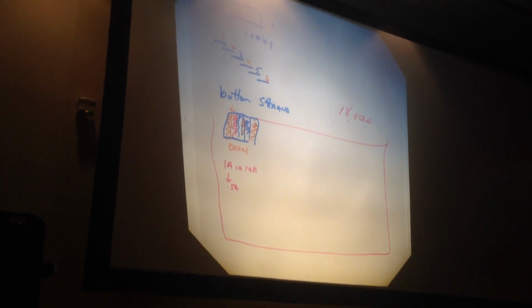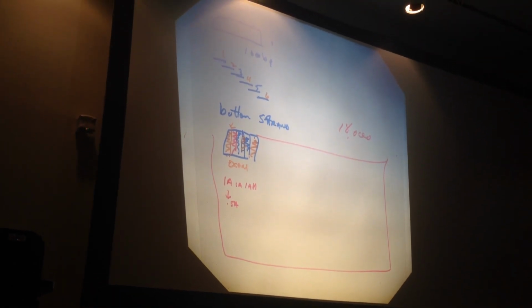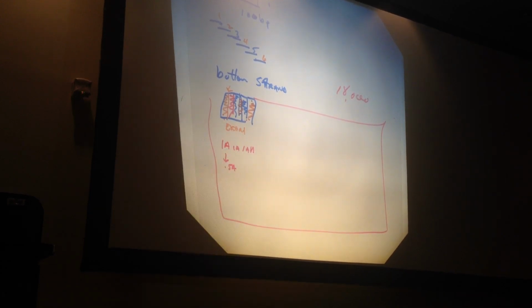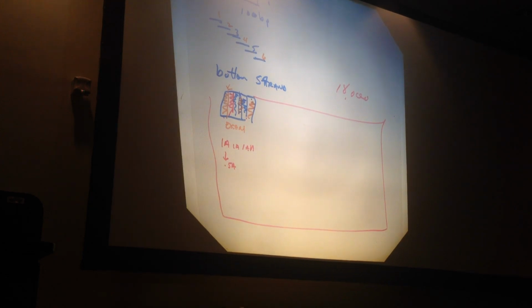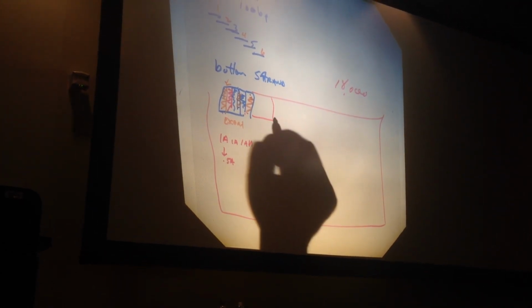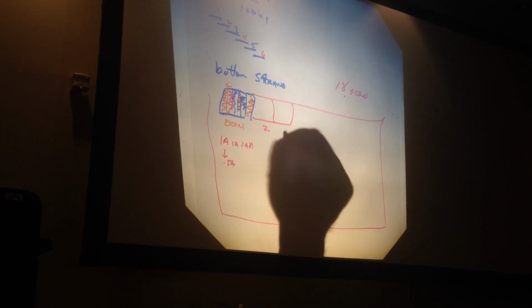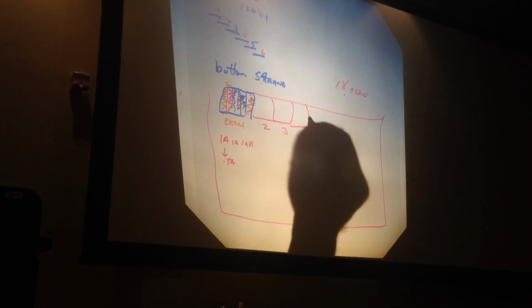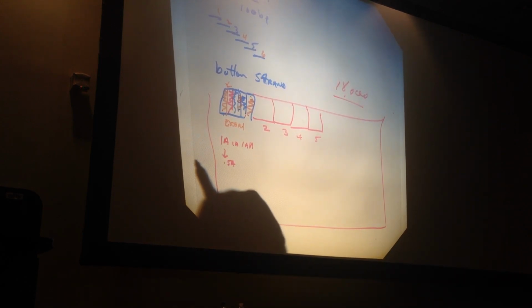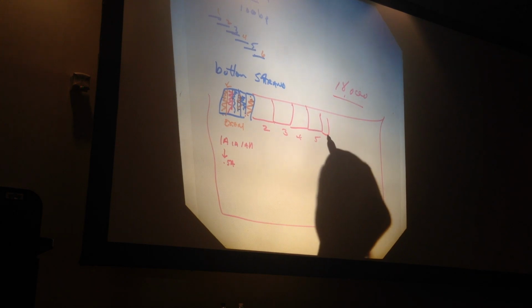In fact, they do something a little different. They actually purposely cut up the RNA. And you could also use cDNA as well. Let me just finish one more thing before we go on. You can do this for all the exons. That's exon 1. You can do exon 2, 3, 4, 5. You have a lot of space on this chip, at least 18,000 units. 5, 6, 7.